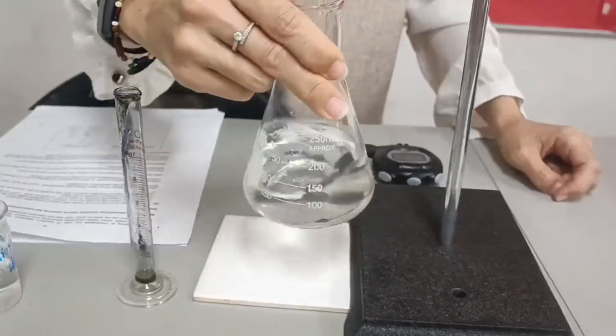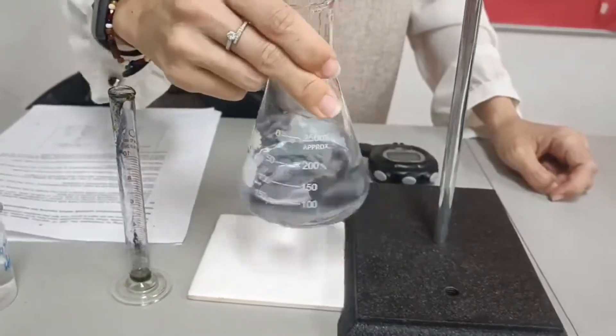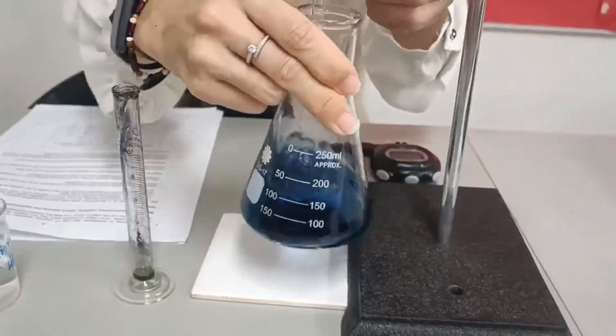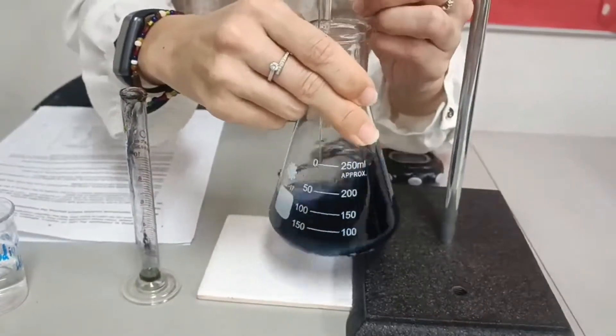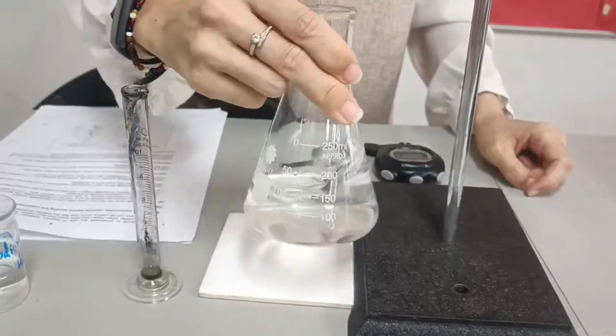And when you add the thiosulfate solution, you have to keep on swirling the solution. That's your next reading. And you keep on doing this until you have added 4 ml of thiosulfate.